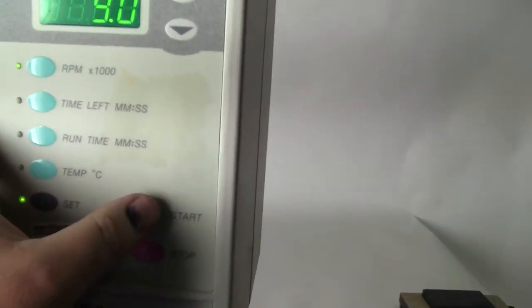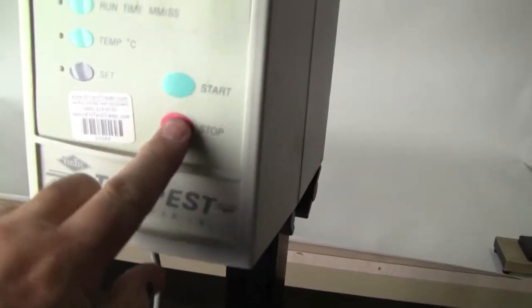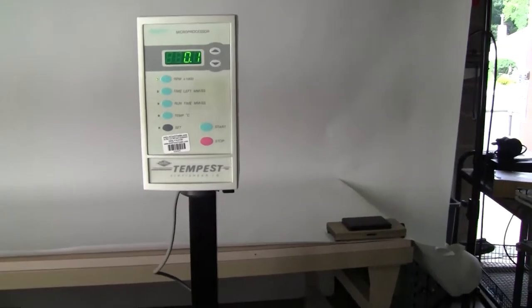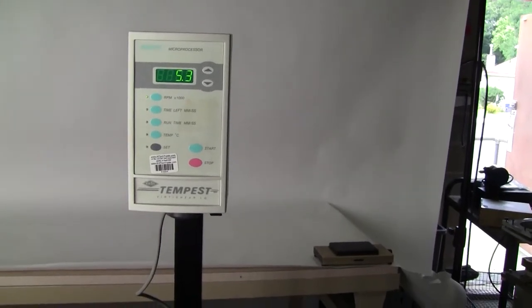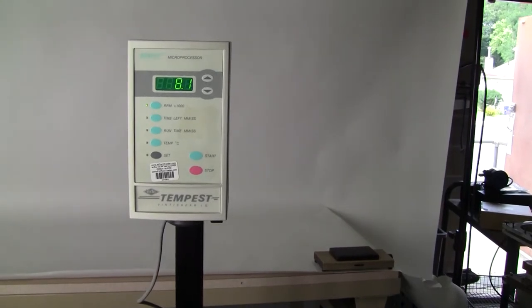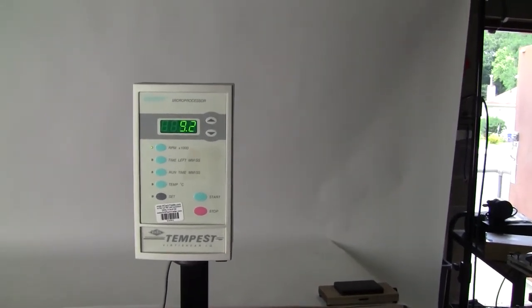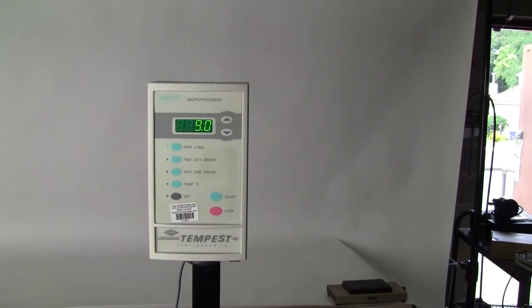Let's listen to it run. Let's take the set point off first. Now let's go. It's set at 9,000 RPMs. There you have it.